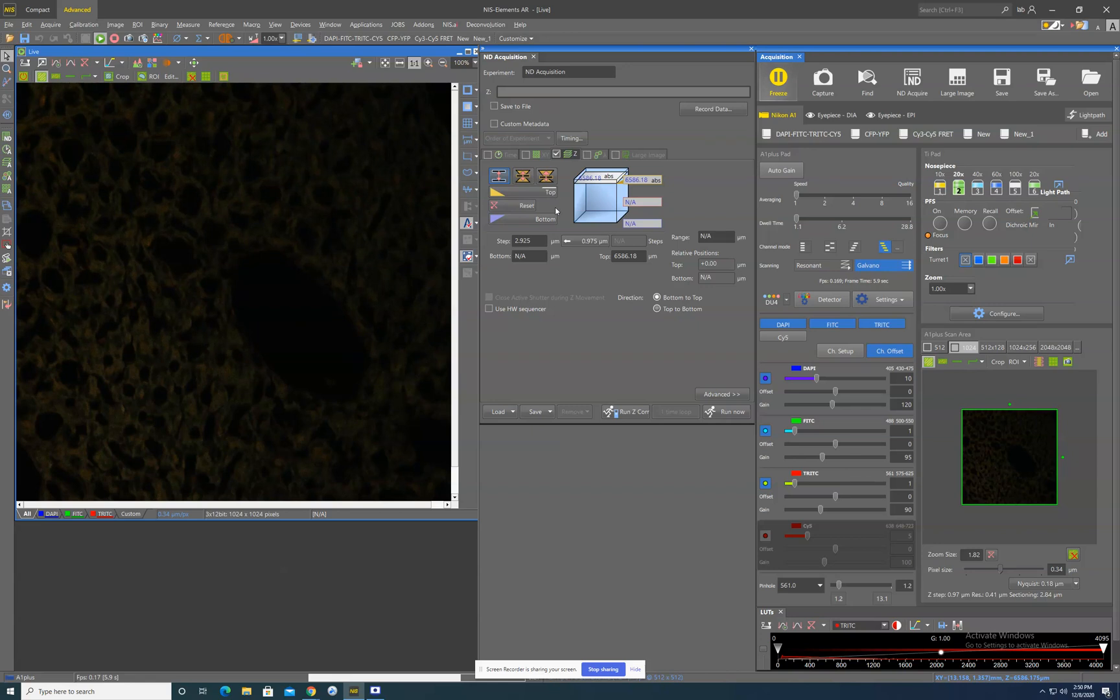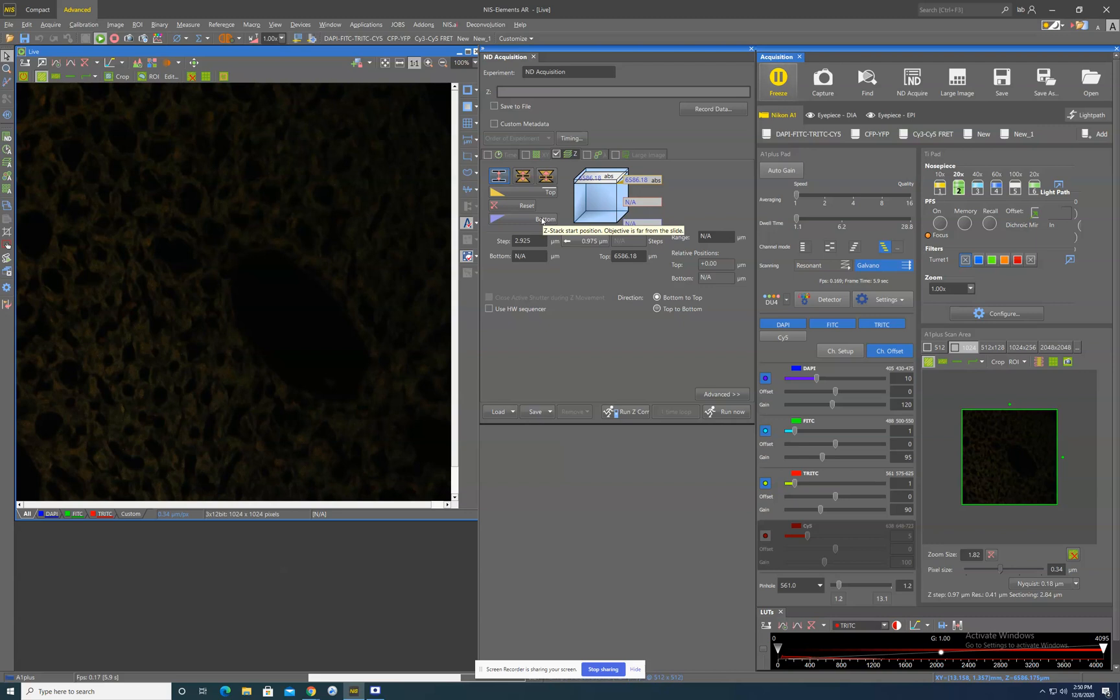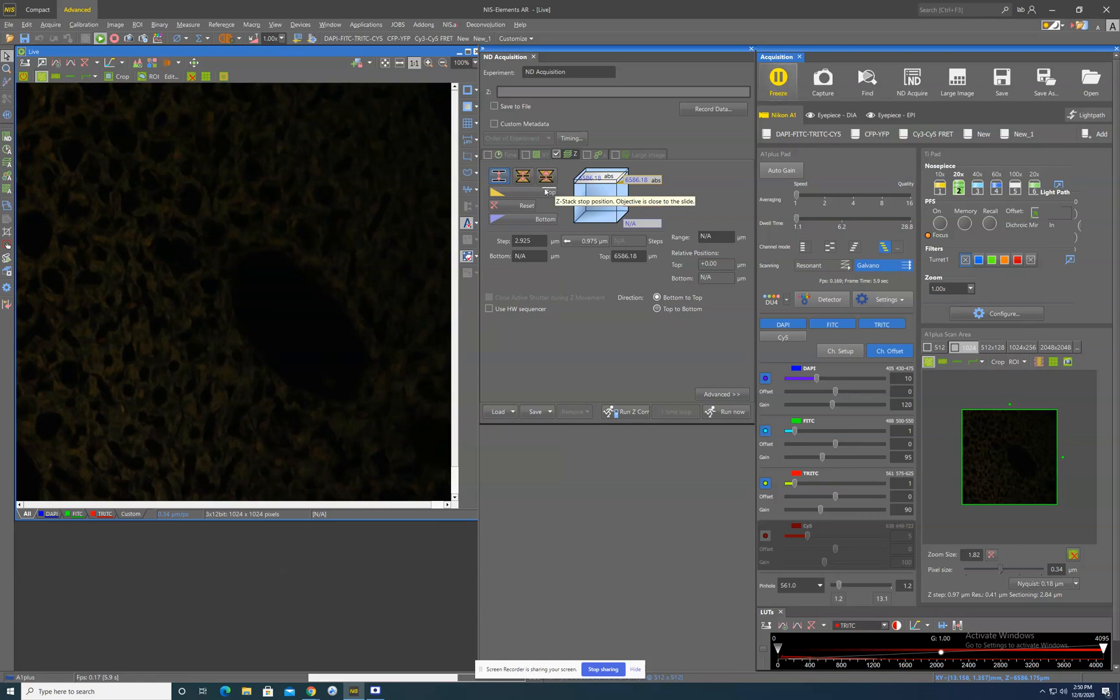So Nikon Elements defines what the top and the bottom should be in terms of whether or not the objective is closer to the slide or farther from the slide. But in reality, the software actually does not care whether you abide by these rules. So in general, we say you pick a direction and then you pick the other direction. It doesn't literally have to match their definition of top and bottom. You just have to pick two points.